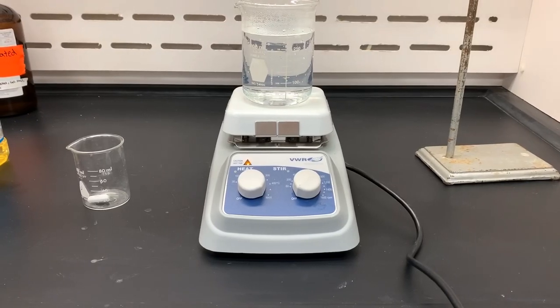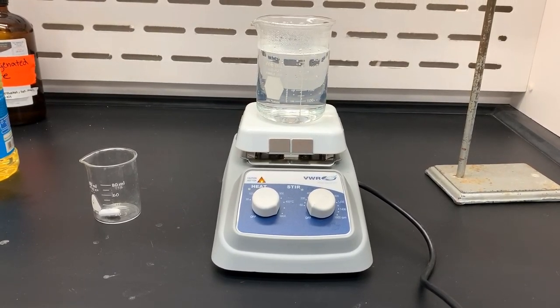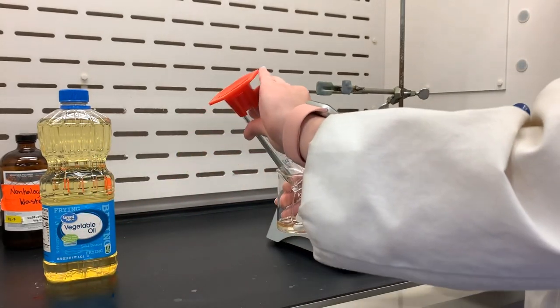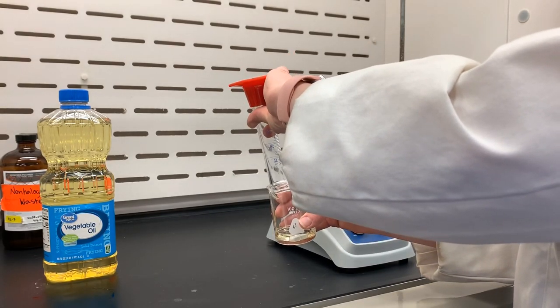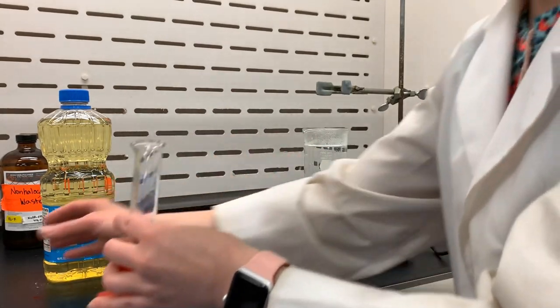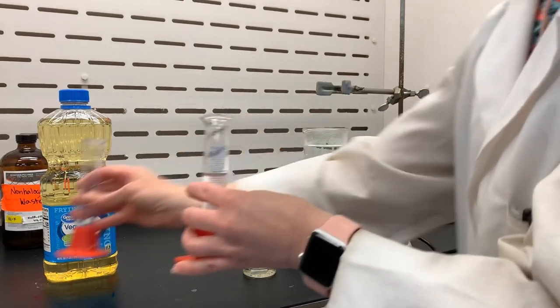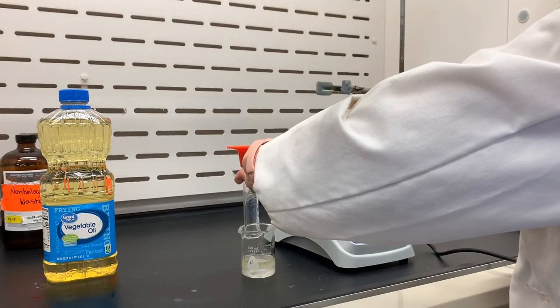We start by heating a water bath to where it just starts to boil, and then to a 100 milliliter beaker that already has a stir bar in it, we're going to add all of our reactants and reagents as mentioned in the lab manual. Vegetable oil first, and then sodium hydroxide solution. I poured it into the graduated cylinder here to make sure to rinse all of that vegetable oil out as much as possible.